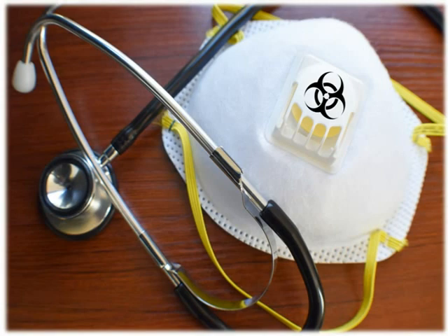Congratulations! You have learned how you would assure proper fit and use of the N95 respirator. The next step is to use the respirator appropriately in your setting. Your organization and supervisor or infection control practitioner will give guidelines on when to use the respirator you have been fitted for, where they are stored, and how you will dispose of them.